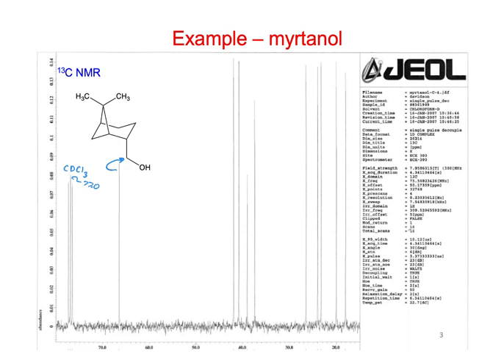Anything else you might propose? Can you say the quaternary carbon based on the small peak? It could be this one here, that one could be the quaternary carbon. Seems like a reasonable proposal. We'll see in a second whether that's true or not.